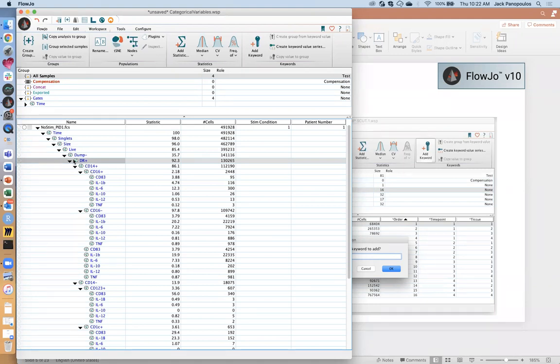In our case here, we have a 13 color experiment. It's not too complicated, but I'm going to keep it here at the antigen presenting cell level. Then we'll try to find the populations that we see here using tSNE or the clustering algorithms that we employ.